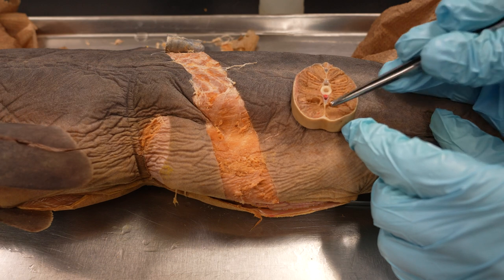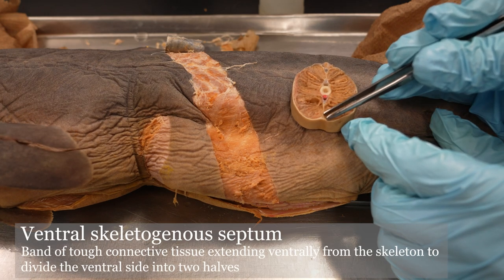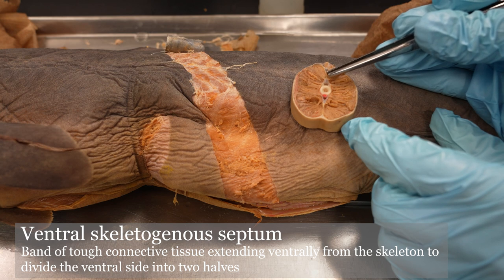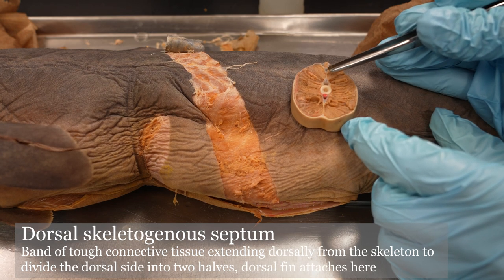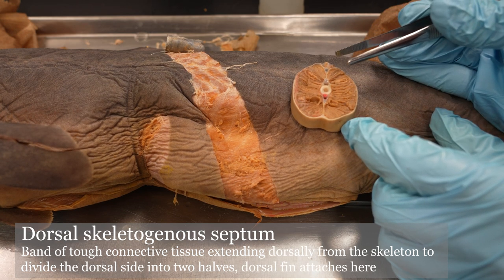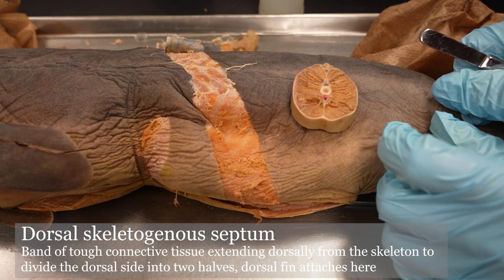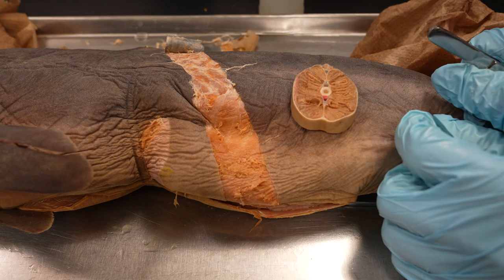We also have a ventral skeletogenous septum in the cutlet that you can see, and the dorsal skeletogenous septum. And that does it for the shark body muscles that we want you to know. Take care everyone, see you in lab.